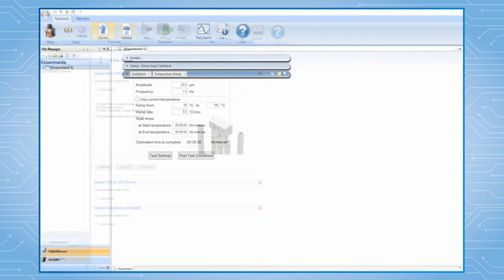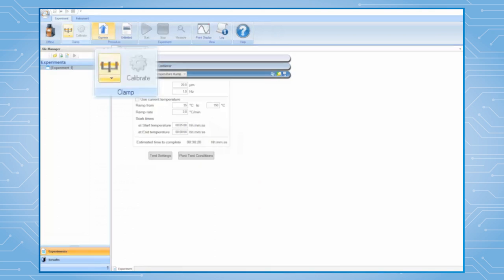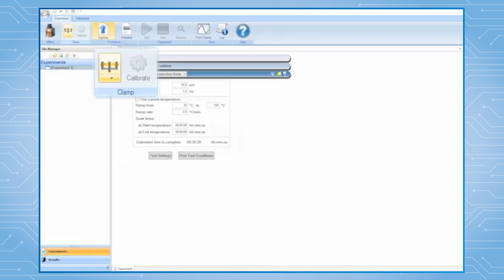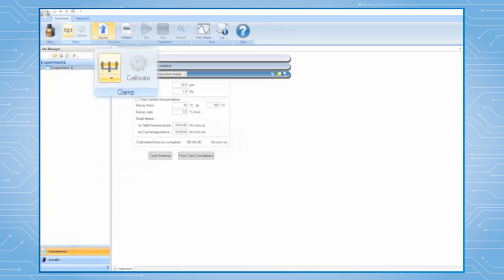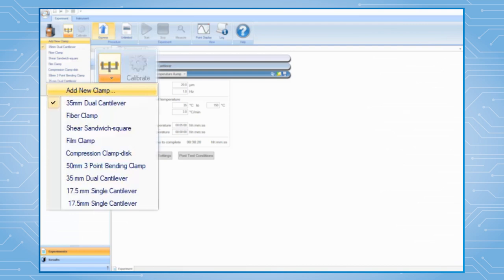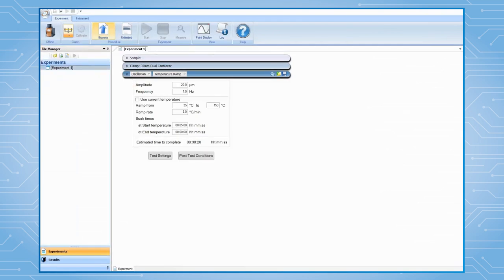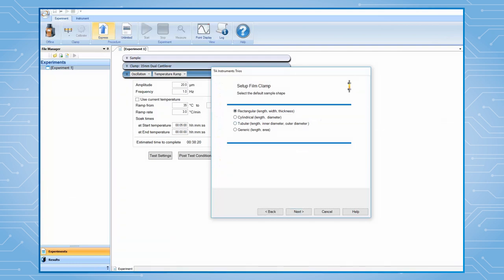If this clamp file has not been previously created, then click on Add New Clamp. Select Film Tension. Then, click on Next. Select the appropriate sample geometry, for example, rectangular. Then, click on Next again.